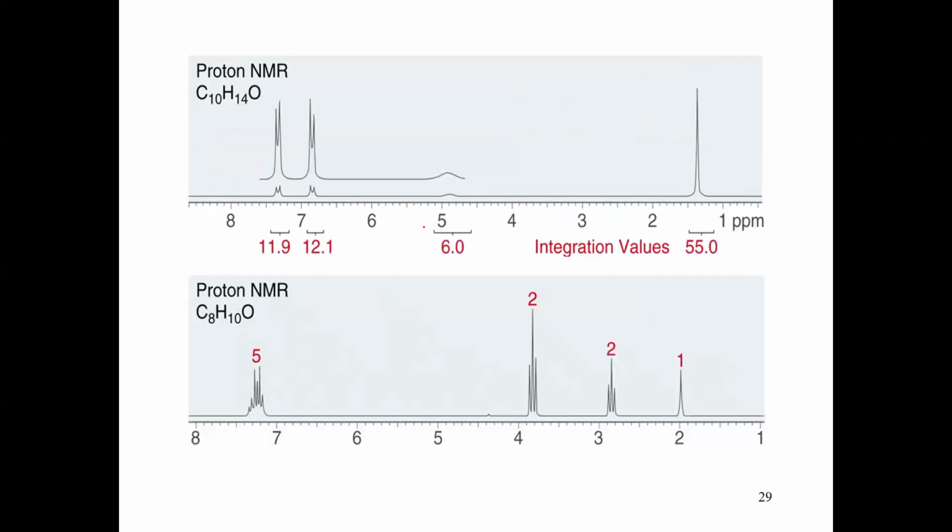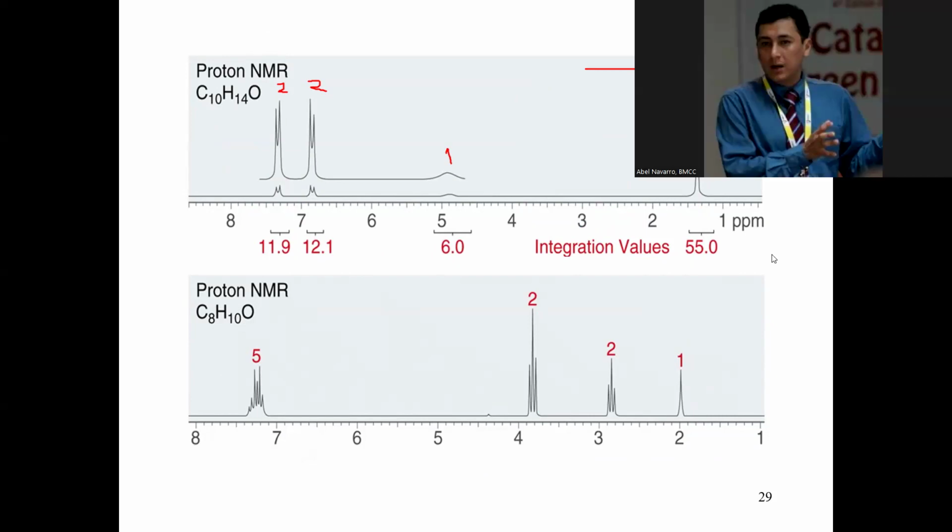Okay, so here they don't give me integration values. They gave it to me to do the calculation. Okay, so we're lazy already how to do the calculation, but let me see, it's double, right? So 6 is my smallest. That would be a 2, 2, 1, 9. Of course, right? Okay, let's do the analysis here.